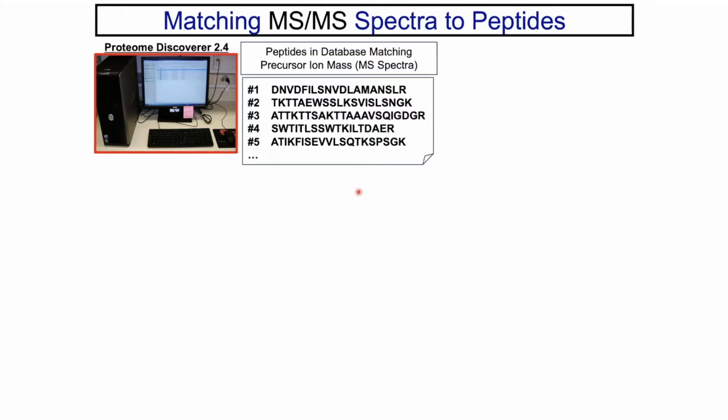We do this analysis on a desktop computer because this software is commercial. It's commercialized, and so it's fairly expensive to get a license. We use it on a desktop computer, although we are able to use multiple cores. We have workstation computers that have a large amount of RAM and a good amount of processing power. This is just an example of one of our analysis computers.